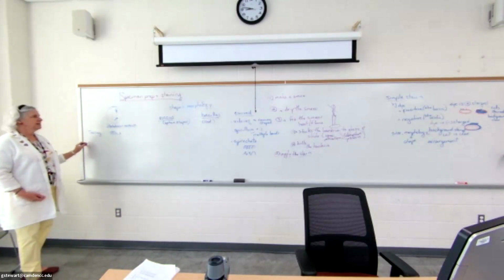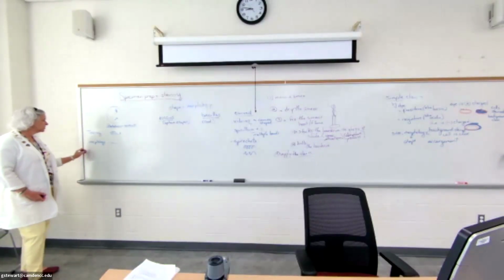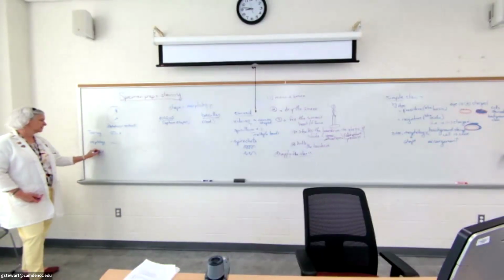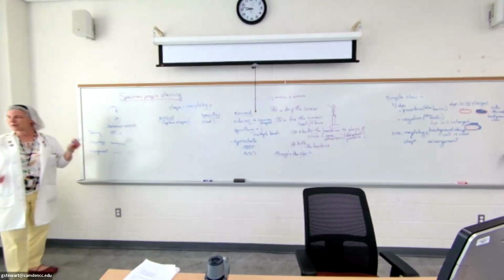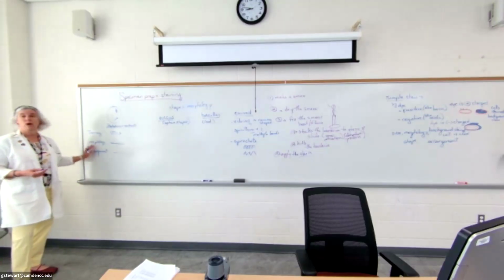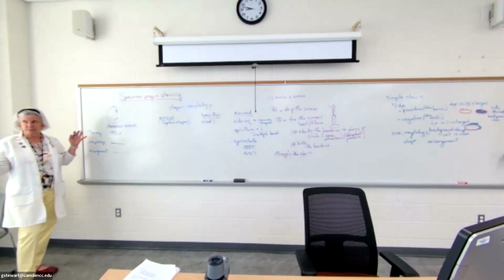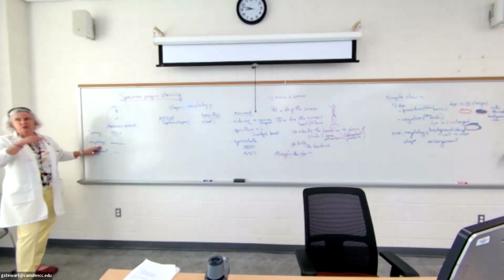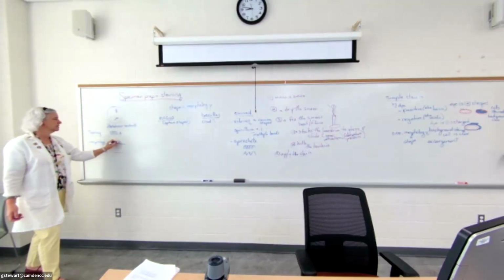And then under that, it's going to say morphology. And then it's also going to say arrangement. And this is one of the difficult things, because in the first lab or 2, on negative staining also, they leave them as separate lines. But today's lab, we're going to do the gram stain lab. You're only going to get 1 line, and it's going to say morphology and arrangement. It's just how we try to make you learn it. Now, morphology is just the morphology. So what shape are these bacteria? Coccus. So I'm going to write that here.